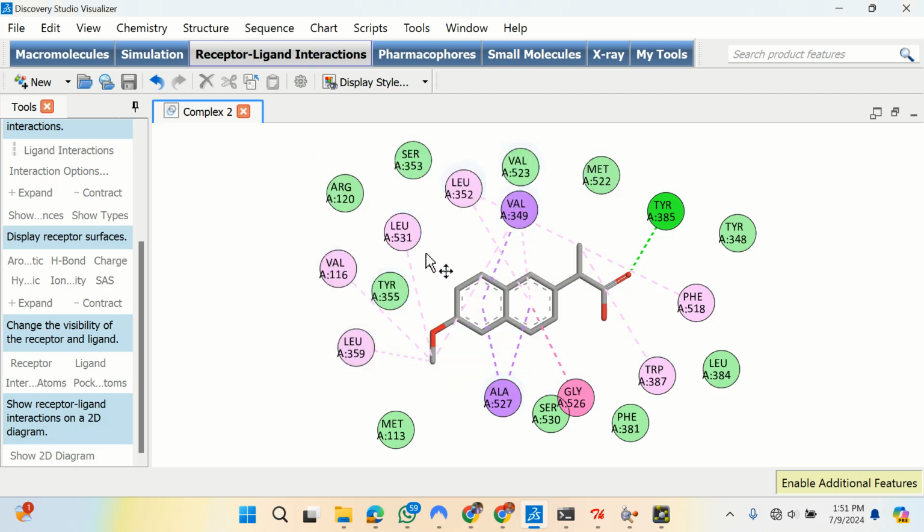Also, if you have saved like this and you're already working with the document open, okay, to copy, or even if you want to work with the one you saved, open the one you saved and do a screenshot of it instead of opening it as an image. If you copy an image and you start your work, what do you think will happen? The big blur because it's a picture, okay? But you can screenshot this or snap this, okay?